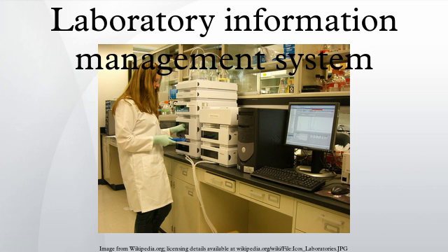In fact, the transition from proprietary databases to standardized database management systems such as Oracle and SQL has arguably had one of the biggest impacts on how data is managed and exchanged in laboratories. Additional functions: aside from the key functions of sample management, instrument and application integration, and electronic data exchange, there are numerous additional operations that can be managed in a LIMS.